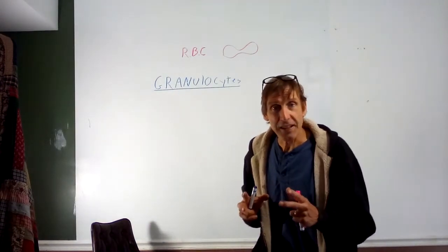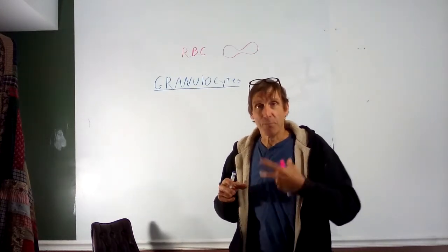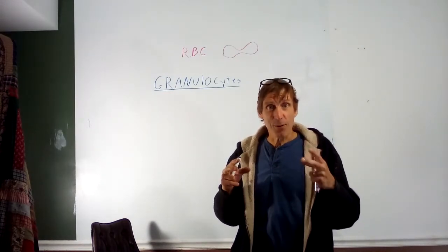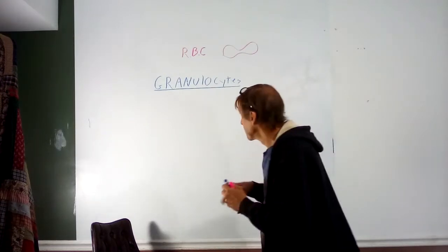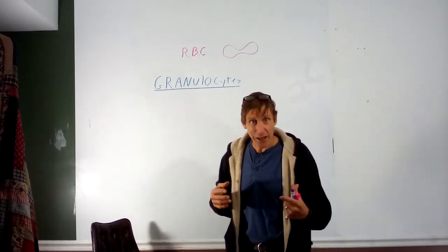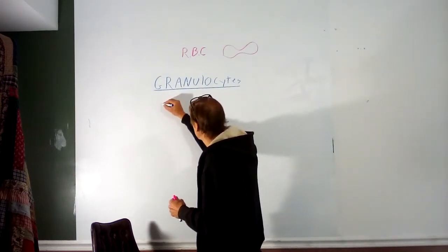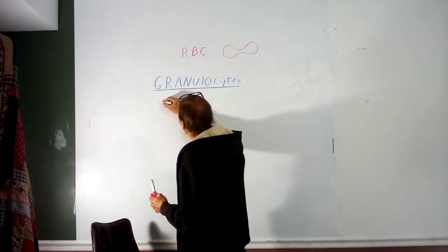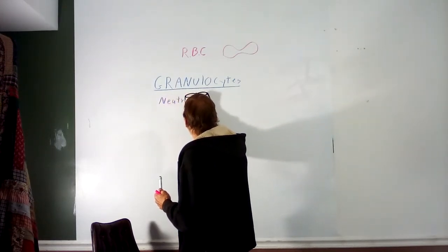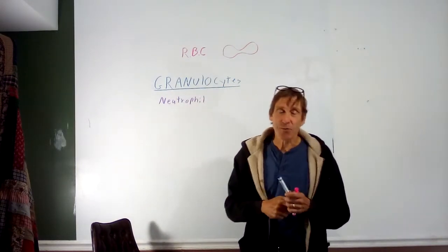Now, the way you'll identify these things is based on the morphology, the characteristics of the nucleus, which will stain a dark bluish black, and in the cytoplasm, there may be cytoplasmic granules, little inclusions, vesicles, that sort of thing. As you can guess, the granulocytes will have granules in the cytoplasm, depending on the prep and the magnification you're using. So the first one, the most common type of granulocyte, is a neutrophil. Now, you're going to have to identify these, which really isn't too bad.